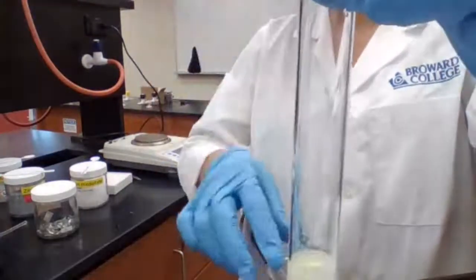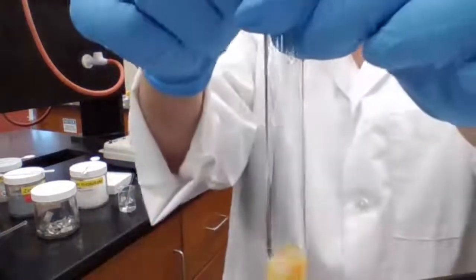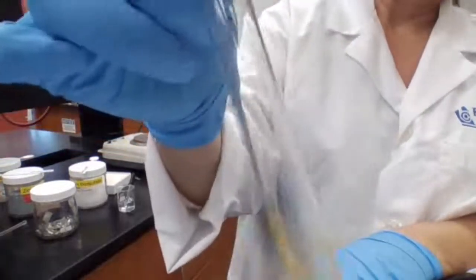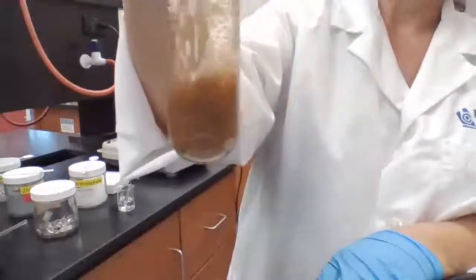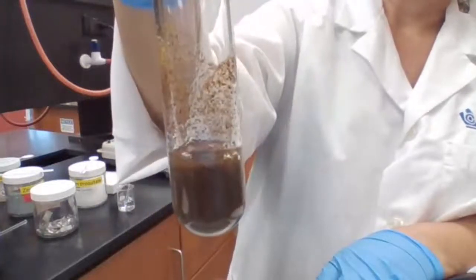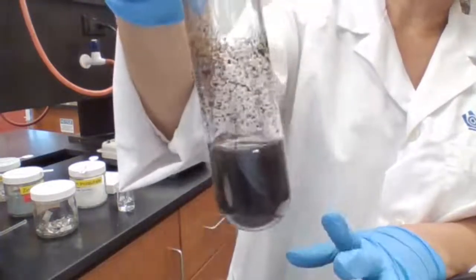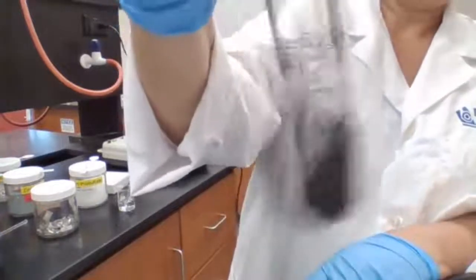Okay, a white crystal formed first. Now the color of the crystal is changing, it is getting to a darker color. White crystals form, and the color of the crystal is changing from the white color. It went to like a yellow color, and then gradually to a black color.